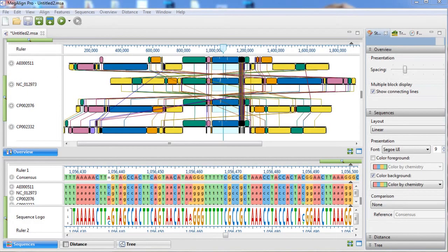In this video, we'll show you how to use Mauve for multiple genome alignments in DNASTAR's MegAlign Pro application.